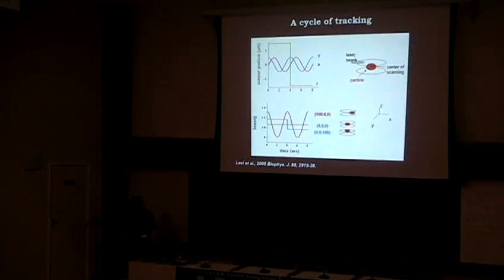Now, imagine we do that in two different planes. So we have our objective moving up and down. The mirrors are making the orbit. The objective, by a piezo system, is going up and down. So we do one orbit at one plane, and again, half that distance of our, let's call it the PSF, or point spread function, which is what describes this excitation volume, with half the PSF.